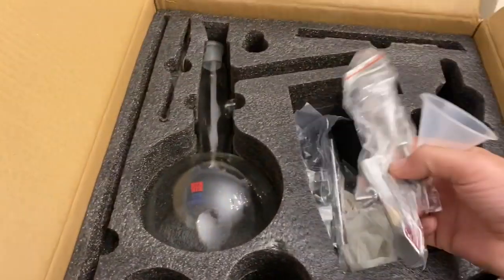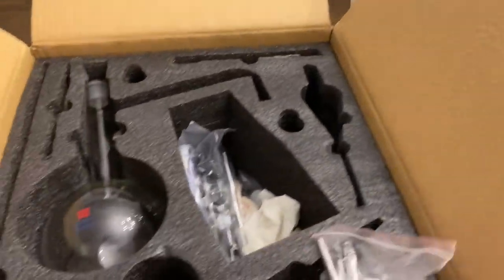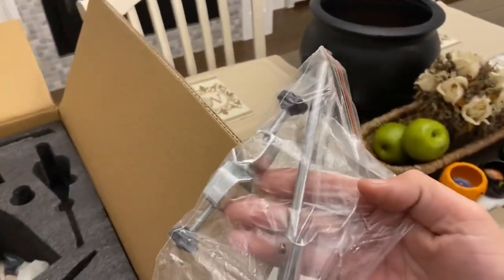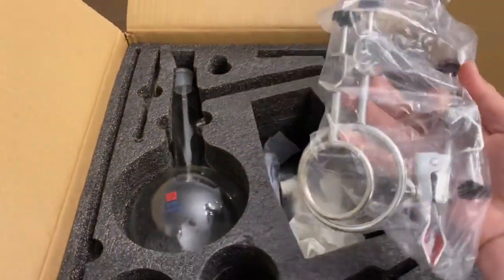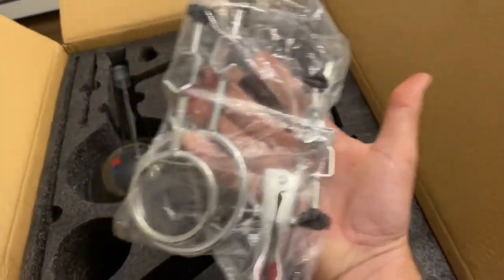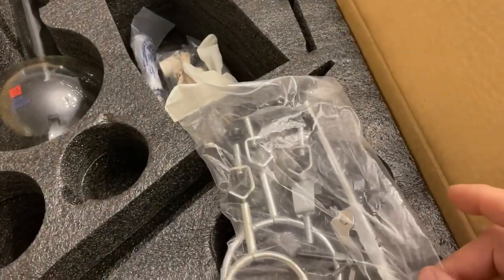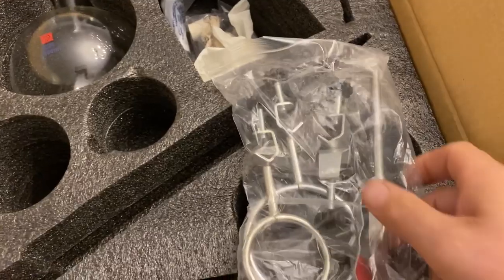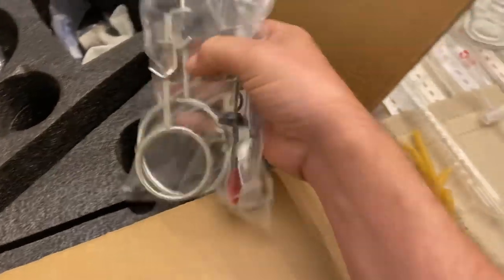This is neoprene tubing which connects to that and you'll run off a small pump in a bucket. Here's the metal stand that it comes with, a little funnel, and more pieces that go on the stand to make the bracket — you'll see how it works when it's all set up. More stands and brackets. The quality is just unbelievable — all stainless steel and aluminum, very heavy gauge. The inside of the clamps are padded so they don't damage the glassware.